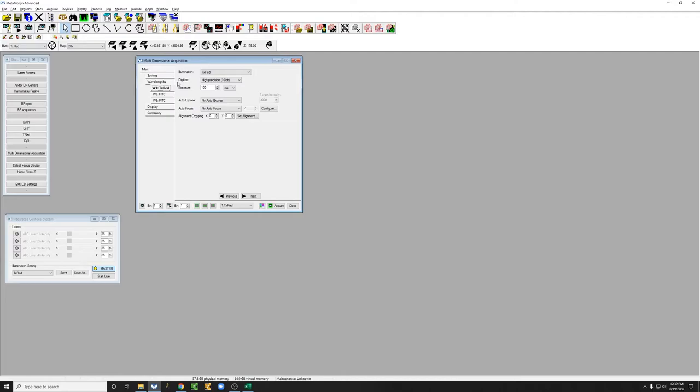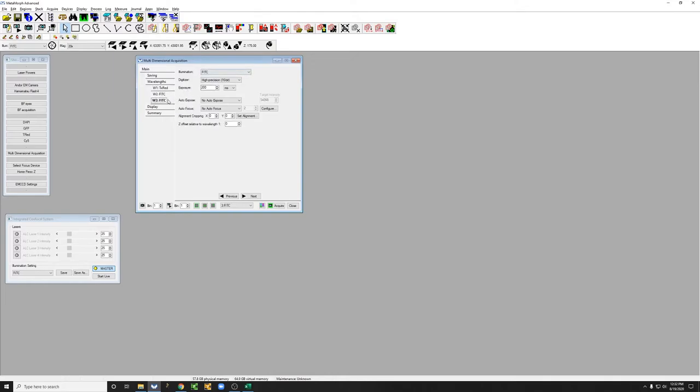I always recommend that the order you go in is from longer to shorter wavelengths. So in our case, that would mean Texas red first, which is what it says here, FITC second, and for the third that would be DAPI.